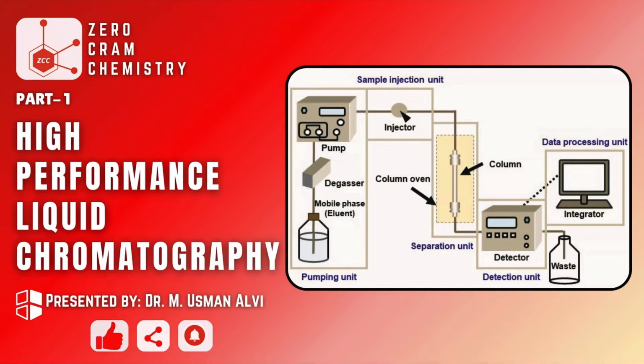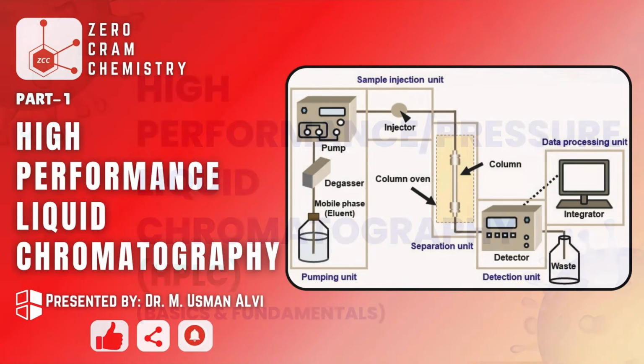So today's lecture is about high performance liquid chromatography, and this is part 1 of this lecture. In this particular lecture we will discuss the basics about HPLC, or high performance liquid chromatography.